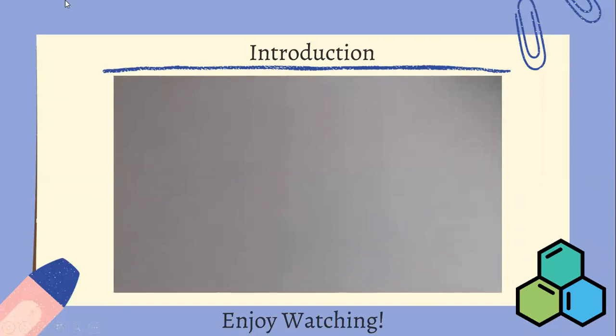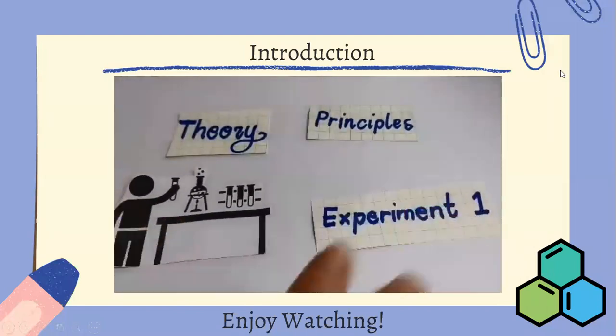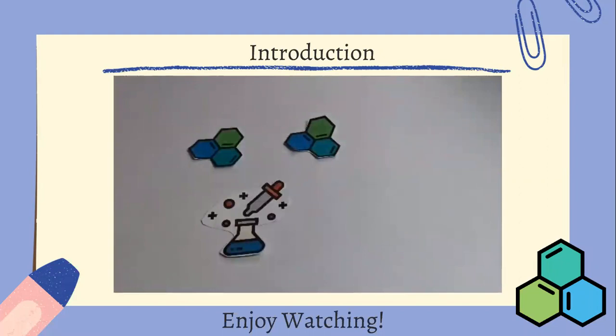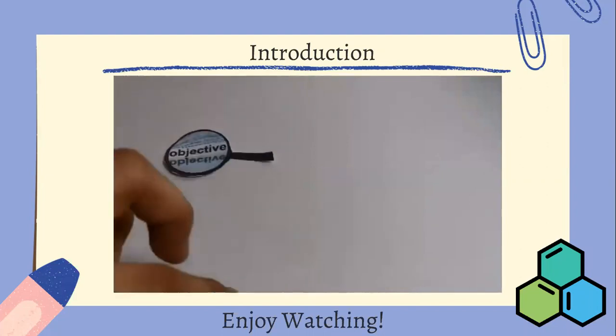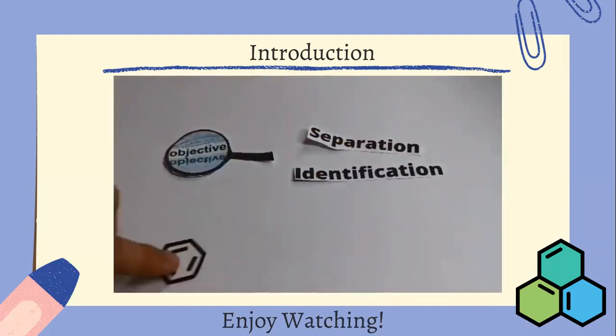Hi, now I will discuss to you the theory and principles that can be used in performing Experiment 1. The analysis and identification of unknown organic compounds constitutes a very important aspect of experimental organic chemistry. There is no definite set procedure that can be generally applied to organic qualitative analysis. A major objective of this experiment is separation and identification of unknown organic compounds.